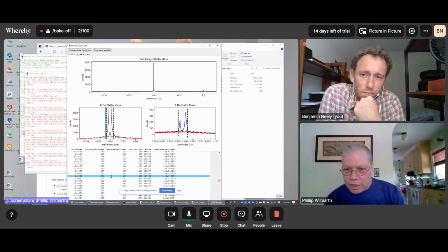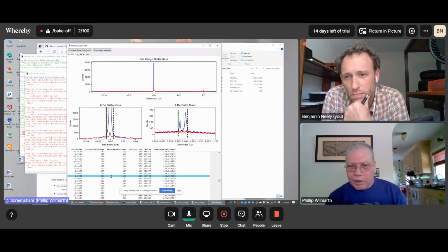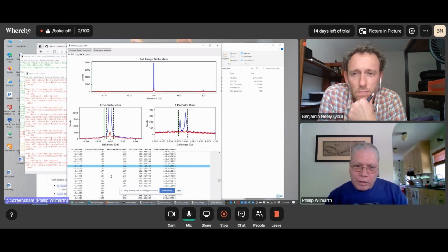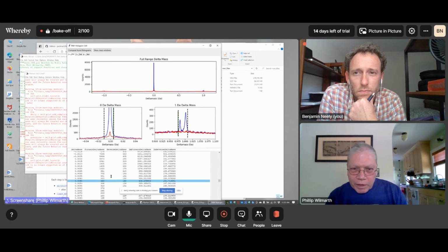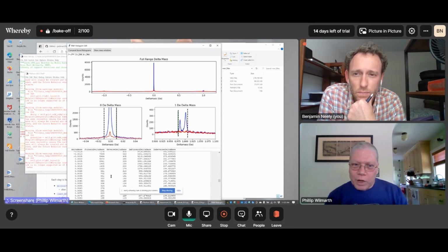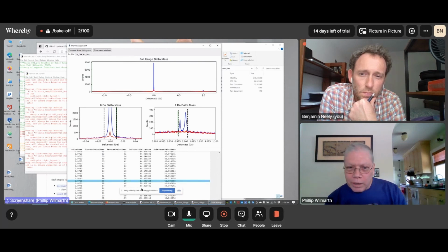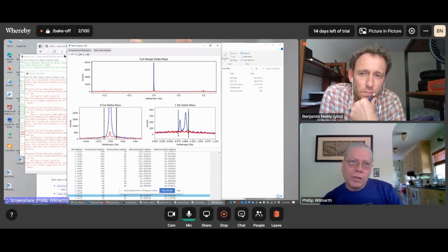So what we do is we go down and click in the table to get the GUI focus onto that widget. And then we can specify with the left arrow that we're working on the left threshold, and then we use the up and down arrows to move it around. Now we just broaden it out by going up in the table. And then if we hit enter, we've now reset that threshold. Then we do the right arrow to get the right threshold, and then we move that down in the table. So we can broaden that out. And now we've captured all of the 0 Dalton peak. Now here, the 1 Dalton peak is pretty good on the left side, but it might need the right side adjusted just a teeny bit. So we can kind of fine tune these things.